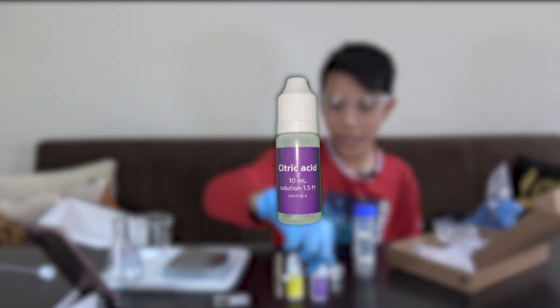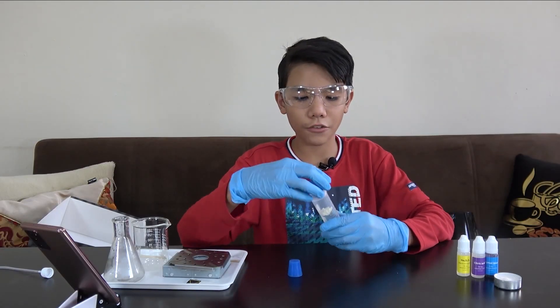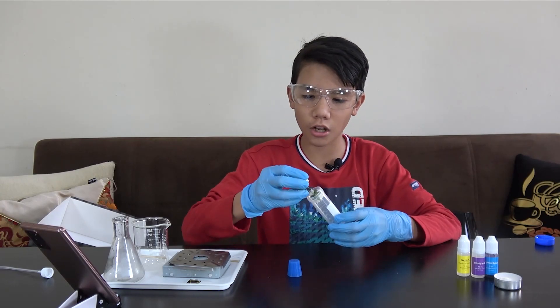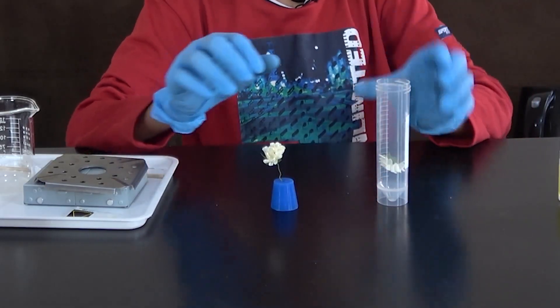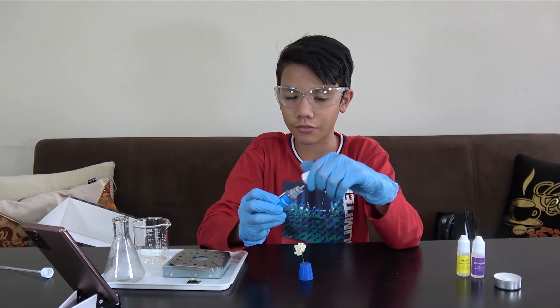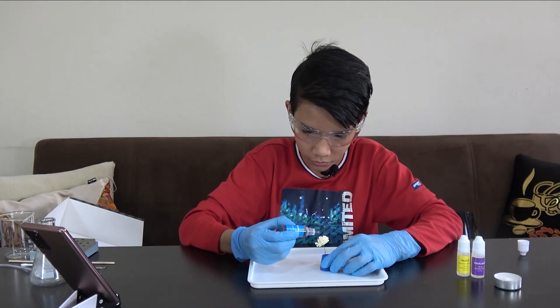We'll also need a thermochromic sticker, a wooden splint, gloves (which I'm already wearing), a tea light candle, and the chemicals included: disodium disulfite, citric acid, and last but not least, thymol blue. My first step is to get a flower and put it in the rubber stopper with one hole, just like this. I'll add a few drops of thymol blue onto the flower petals, doing this over the tray so I don't spill. Bismillah.